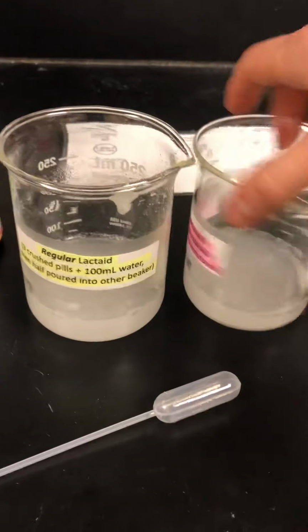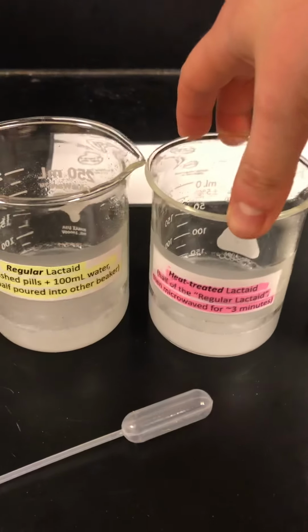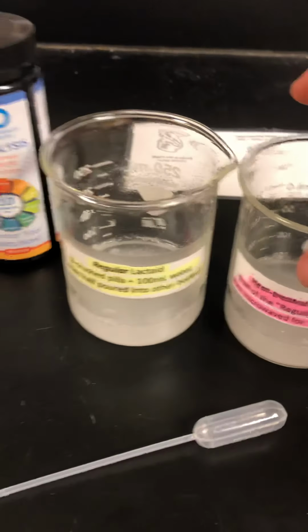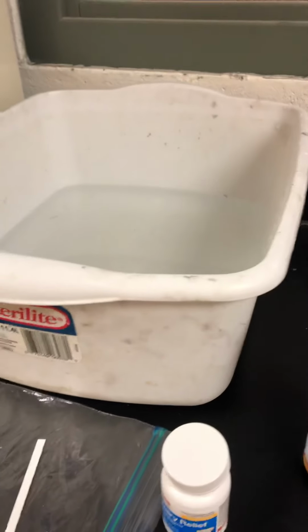All right, so notice I've got one labeled regular Lactaid and the other one labeled heat-treated Lactaid. I'm going to take this heat-treated Lactaid and put it in the microwave for like 3 minutes. Maybe a little less since we've only got one beaker. What we're trying to do here is boil the water, and in that sense the Lactaid will also be boiled, so it's going to reach like 212 degrees Fahrenheit. Once that is done microwaving, we'll put the beaker in a water bath just to help bring it back down to room temperature. In the meantime, I'm going to set up my testing mat.